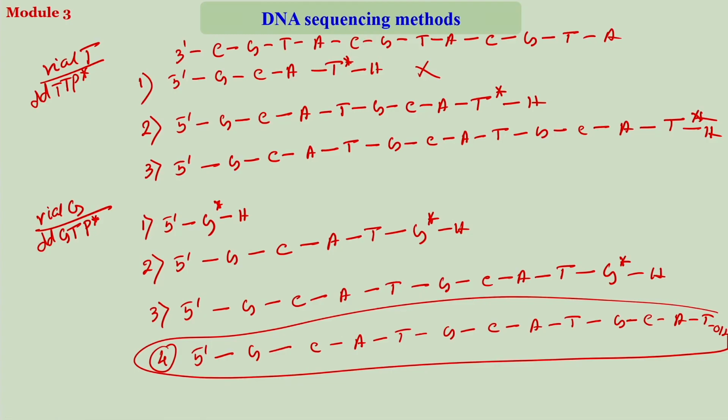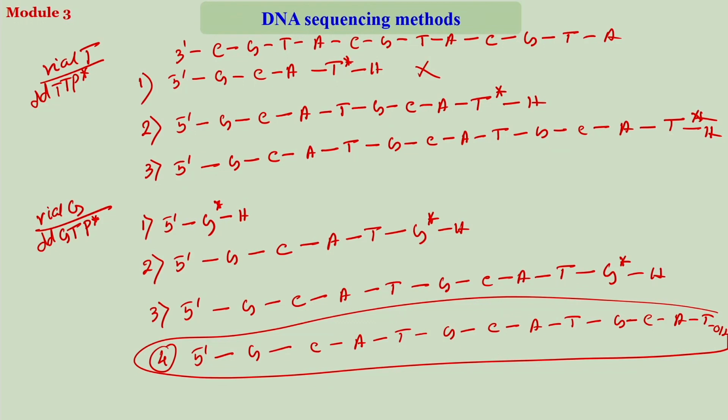So, now you can see so many fragments you have. Now, here comes the chemistry. Since you have fragments, now you can study them. The whole long DNA is hard to study at a time. So, now if you have the smaller sequences, you can study them well. Another thing, did you notice that all of these sequences have different length of the DNA? For example, this is 1 nucleobase long, this is 1, 2, 3, 4, 5 nucleobases long. If you look at all the fragments that we have done, all of them are of different length of DNA.